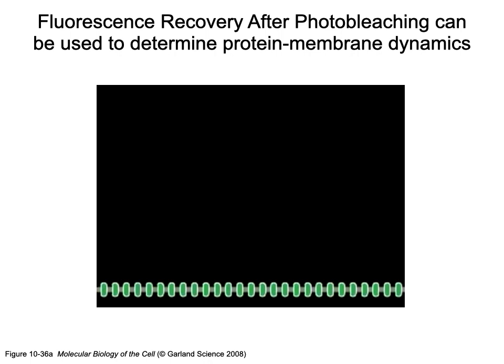Depending upon what type of membrane they're found on can also affect recovery time and the dynamic movement of the protein. So through FRAP, we can learn a lot about proteins and where they're located, how they move, and how the recovery occurs.